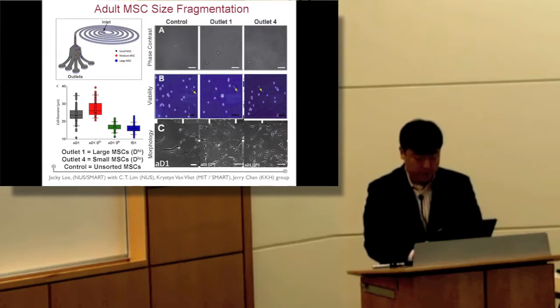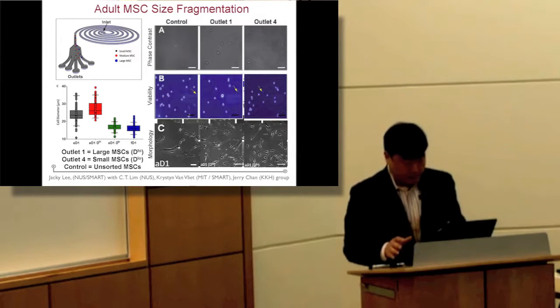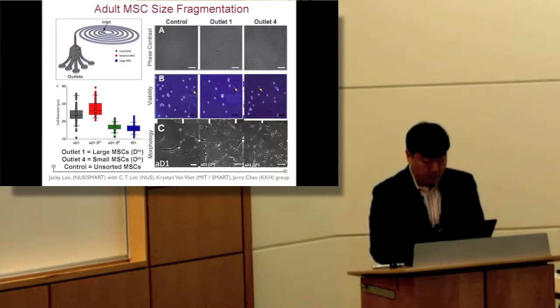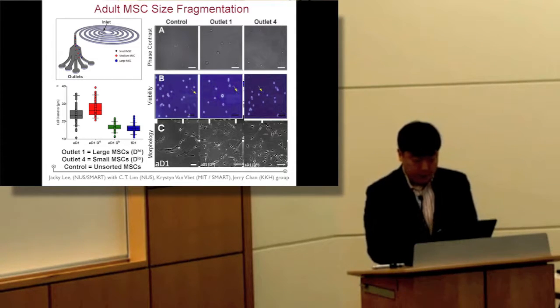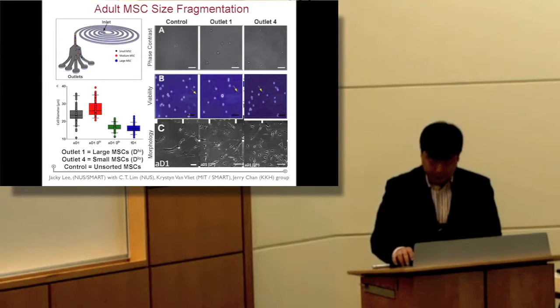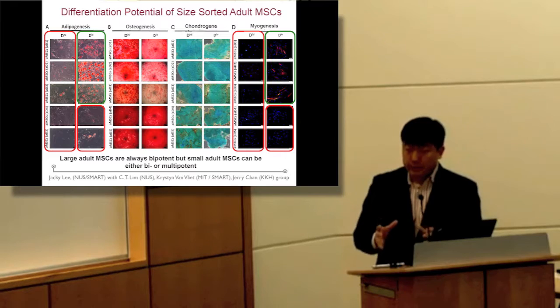So this is one of those experimental results. We can size-separate these diverse MSC fractions into two different populations. D high is the larger MSCs, and D low is the smaller MSCs. Outlet 1 collects the larger cells, outlet 4 collects the smaller cells, and if you grow them in the plate, you can see that the morphology is clearly different. These are really spindly kind of morphology, as they call it. What that really means is that they are really different cells.